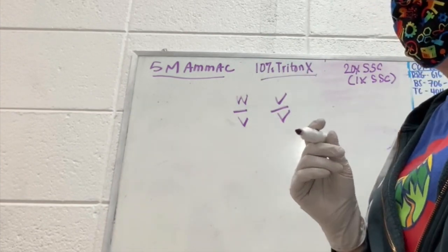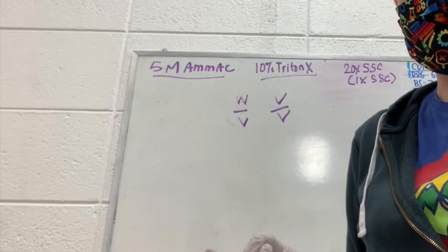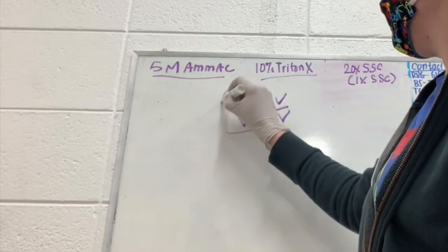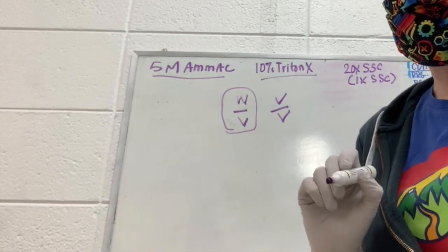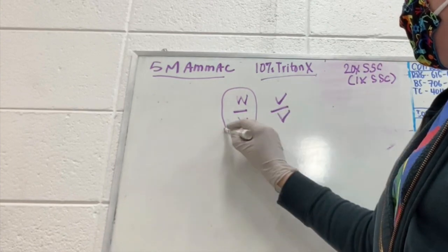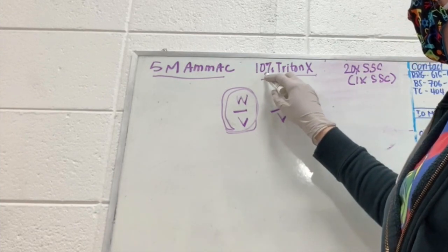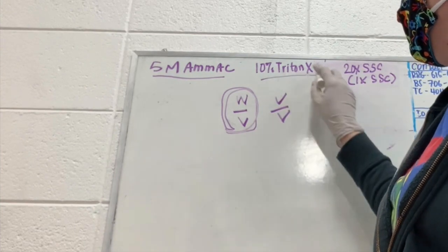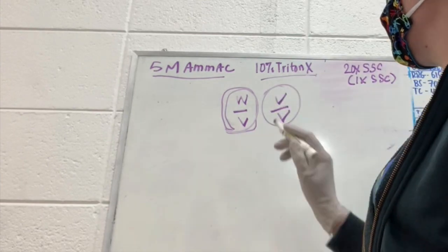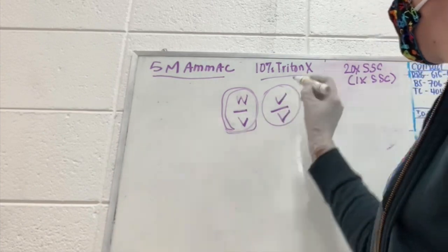So for example, if you make a percentage solution of SDS in the lab, that's a powder, and so you'll use the weight volume formula. If you're doing a 10% solution and the material you're using is a liquid, then you can do volume to volume. So that means that 10% of whatever final volume you use will be this material.